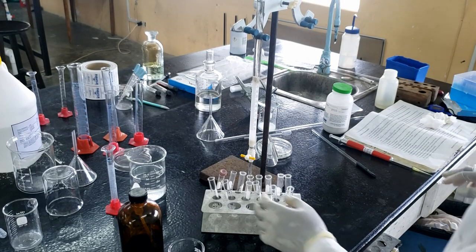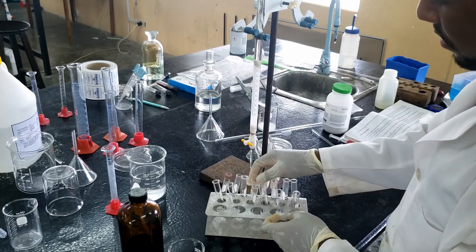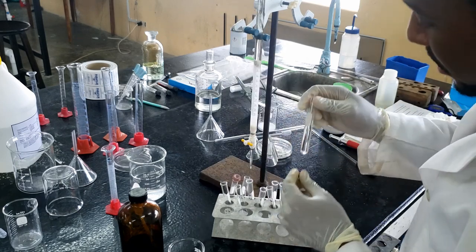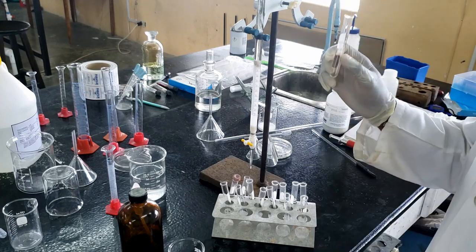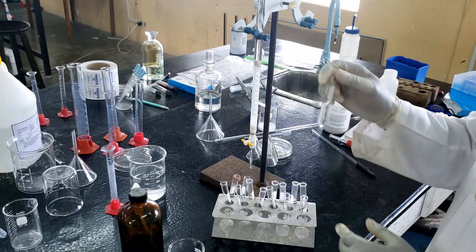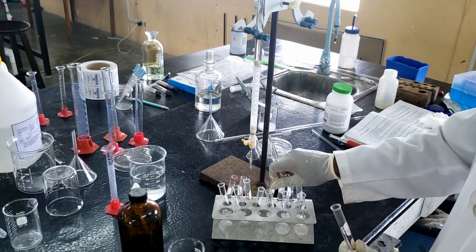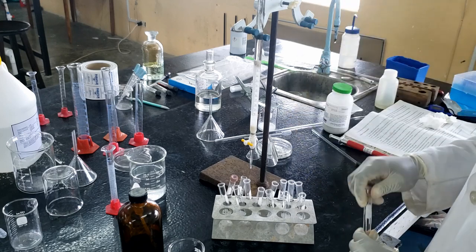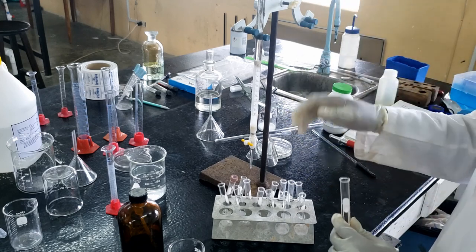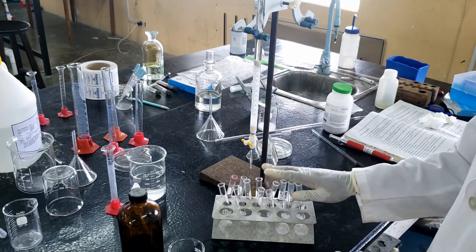So we're at our first fraction, number 5. So we're going to take this tube and we're going to test a little bit of this solution with the TLC. If we do not get any results from the TLC, then we discard all of these fractions and we just refill and continue, and every 5 fractions again we test to see if we have any results on the TLC.